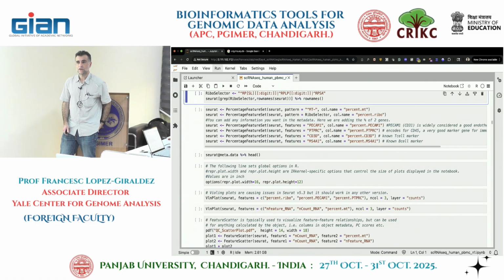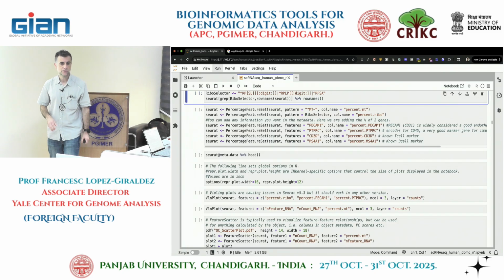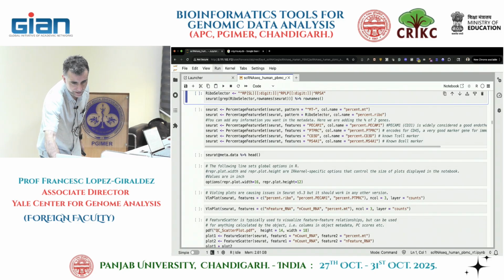It's quite common that we see a lot of ribosomal protein genes being expressed in our data, and sometimes you want to remove them. You want to do what we call downplay their role in our analysis. So we can calculate how many we see in our sample. So here what we're doing is trying to get all the gene names that are ribosomal proteins. Not ribosomal RNA, proteins, okay? Genes that are part of the complex of transcription. So here I'm just testing, out of the genes that I detected, how many are going to be ribosomal proteins. That's the only thing I'm doing, just a quick test.